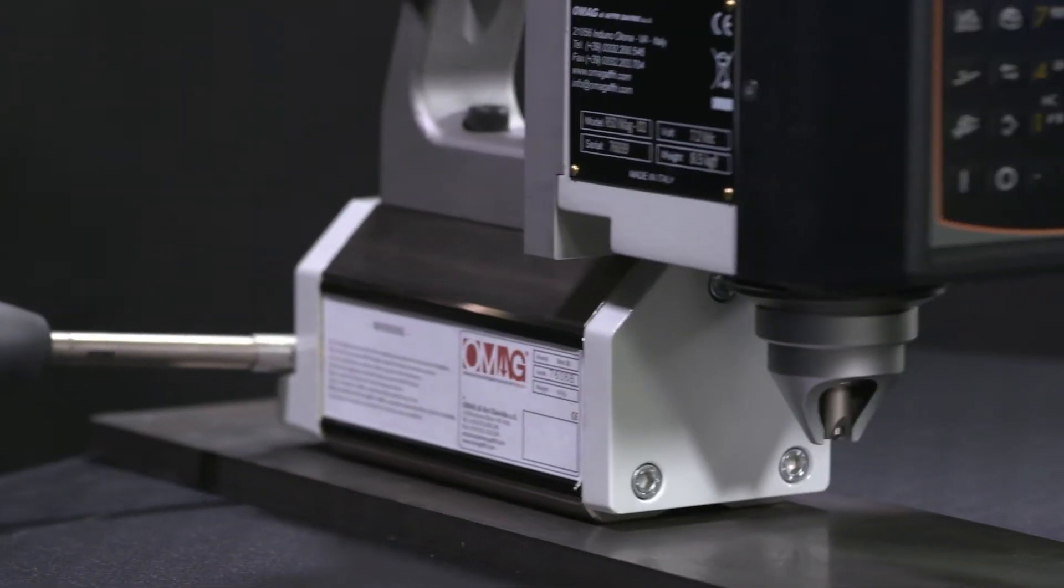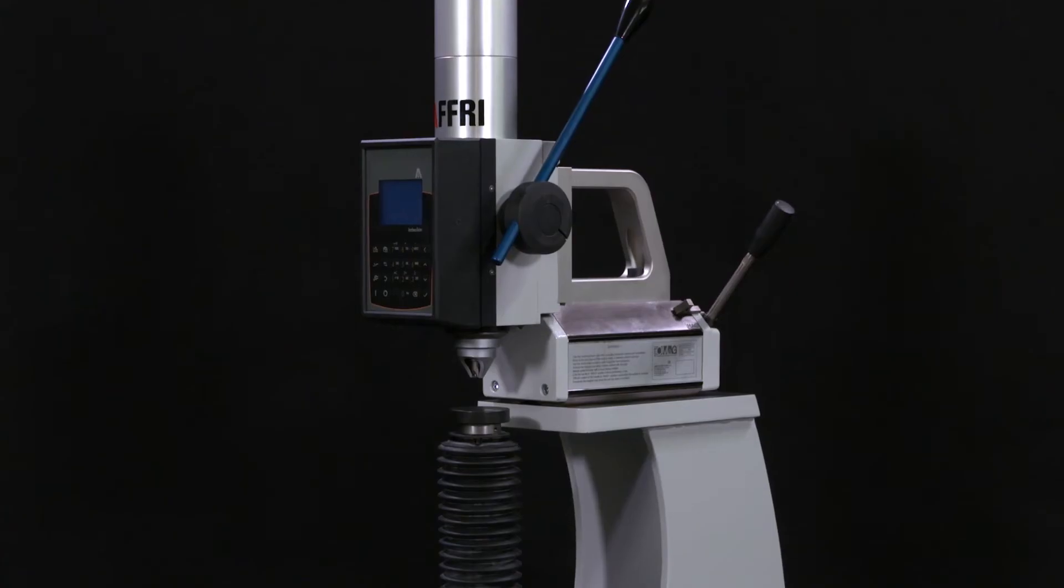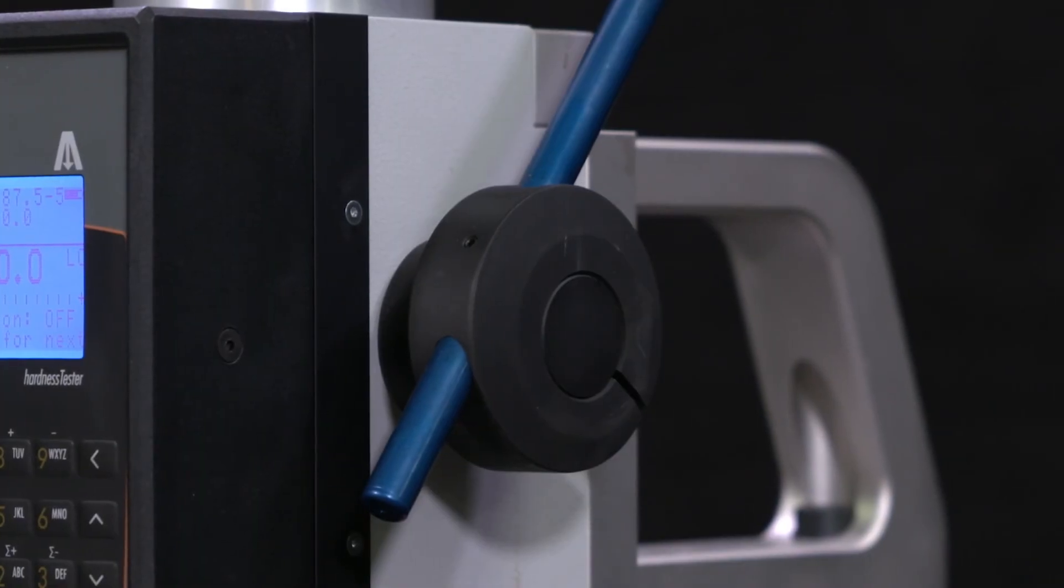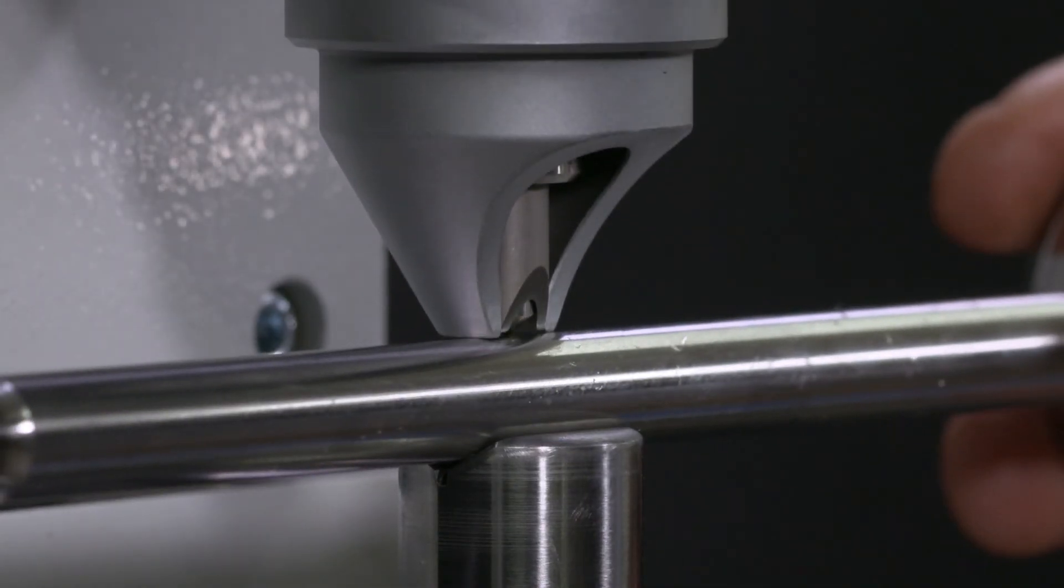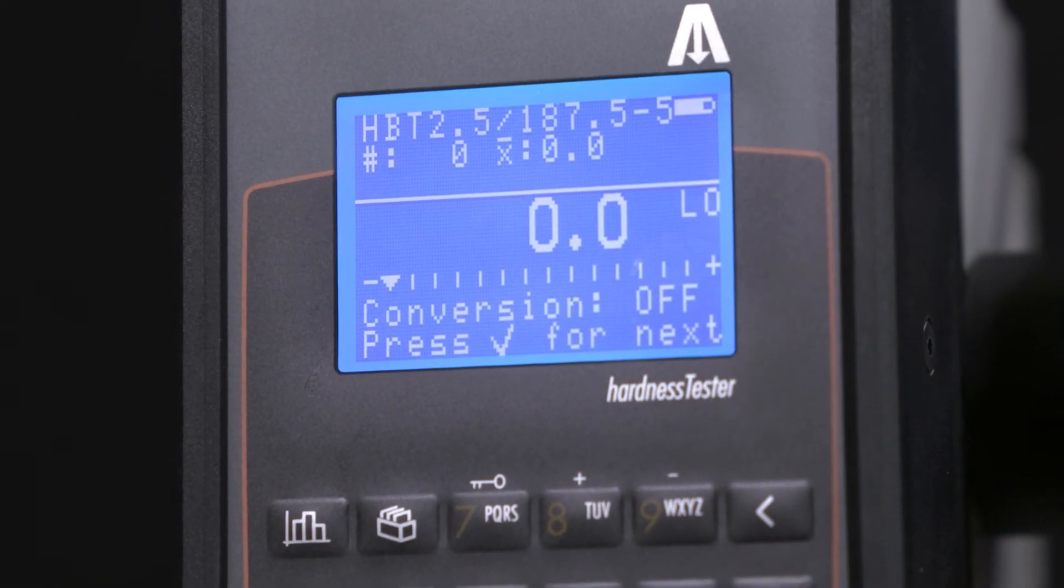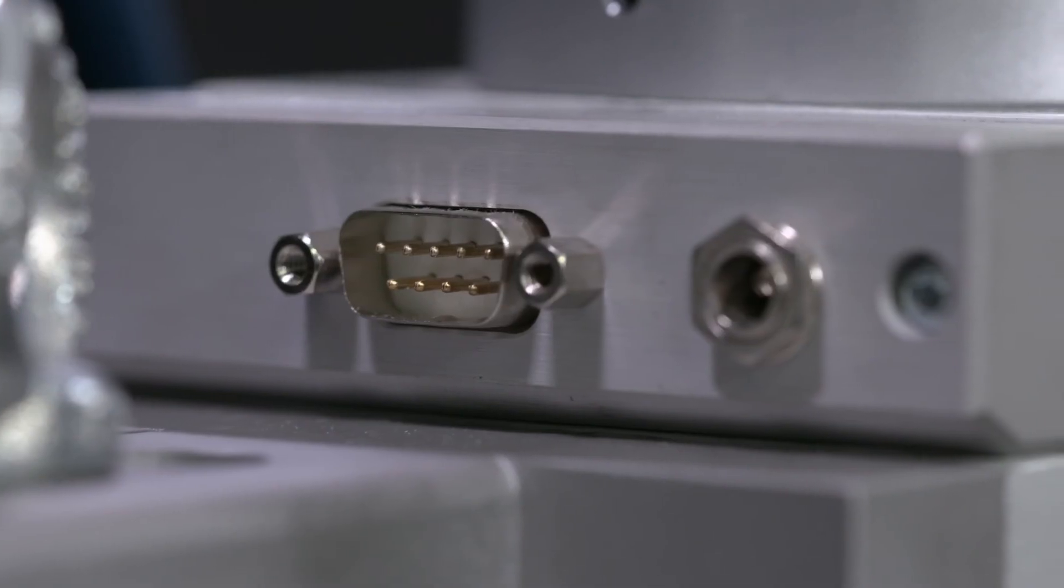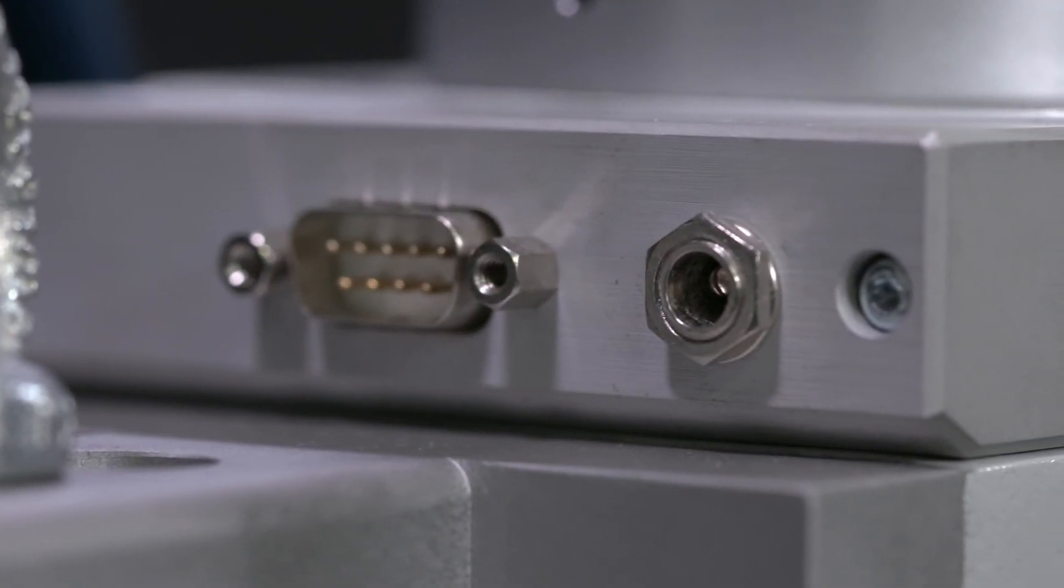The hardness tester can be configured with different types of support, magnetic and non-magnetic, to ensure perfect adherence to every piece, also enabling Brinell HB30 hardness tests to be carried out. The AFRI-RSD-MAG has RS232 and USB ports to export data.